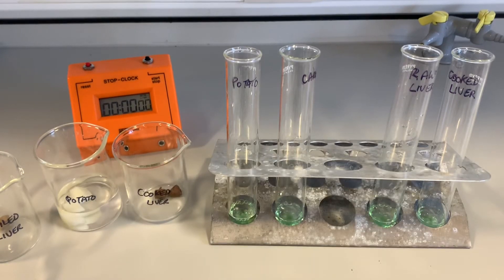In this experiment we're going to be using hydrogen peroxide again. Remember that is the substance that breaks down and it forms oxygen and water. The oxygen is a gas and obviously water is a clear liquid, so it's easier to test for the presence of gas to find out if the hydrogen peroxide has been broken down.